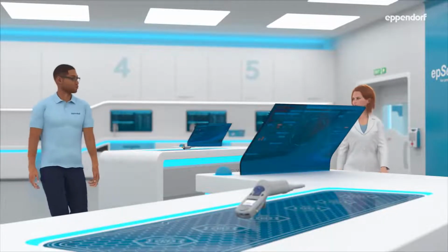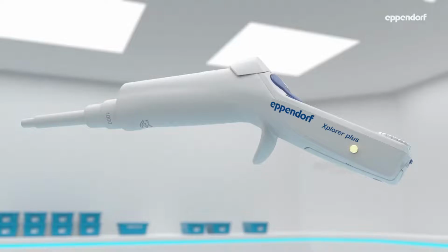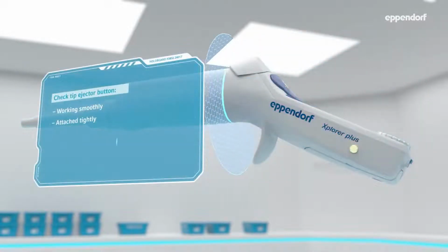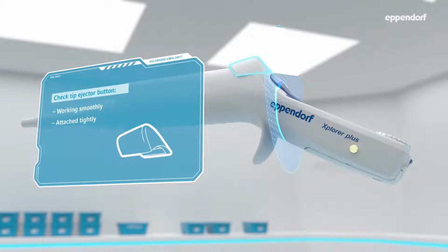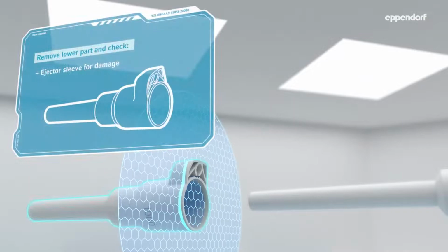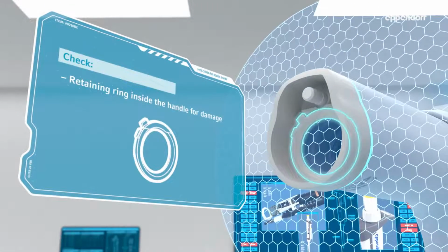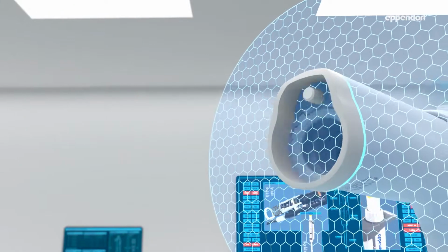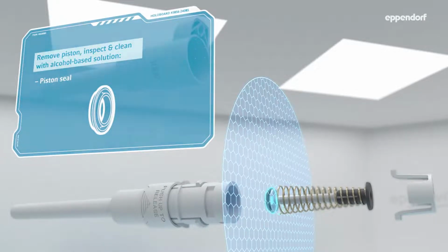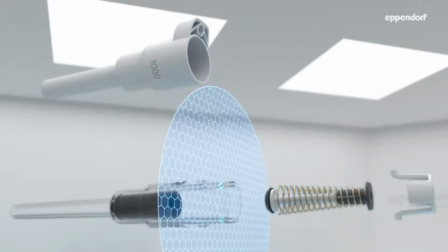Now, let's take a look at the maintenance of your Xplorer Plus pipette from our Electronic Xplorer series. Also, you can download a user guide with instructions on routine cleaning in between professional services from our website.